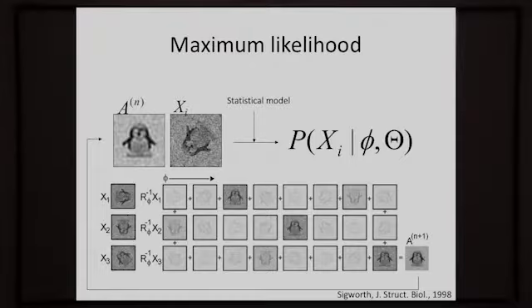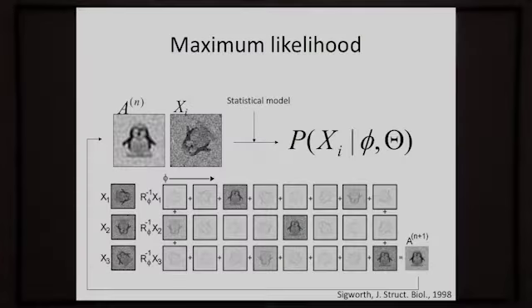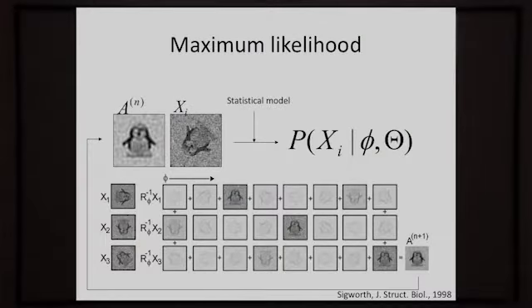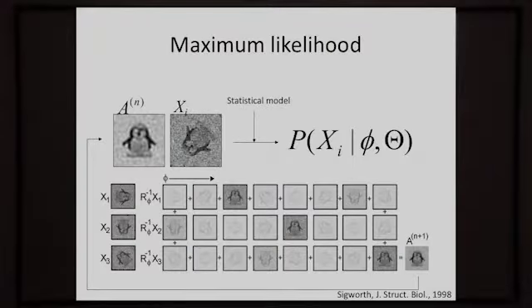If you marginalize over all these probabilities, you do something very different. I'm going to calculate the probability of observing the images in all these orientations, but I'm not just going to take the maximum. I'm going to calculate the average for the next iteration as a weighted average over all those different orientations for every image. So if this is the first image and the relative rotation should be something like 90 degrees, then in this orientation the probability is very low.